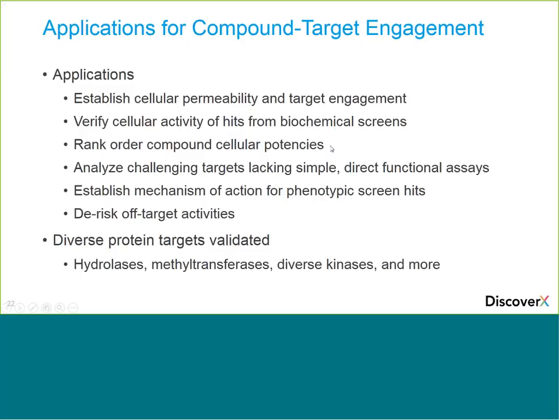This type of technology can also be used to rank order cellular potencies during lead optimization. And I've touched on this earlier, but also analyzing challenging targets where there really isn't a good direct functional assay. Maybe the assay is just cell killing and you'd rather get a little closer to the target.